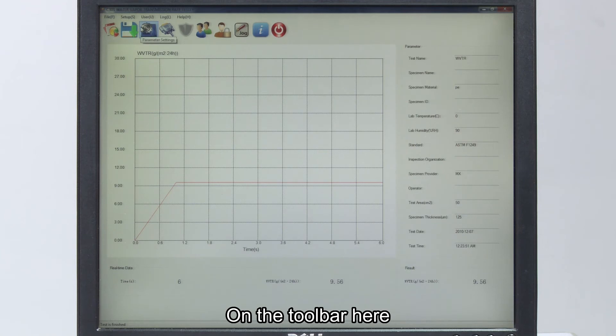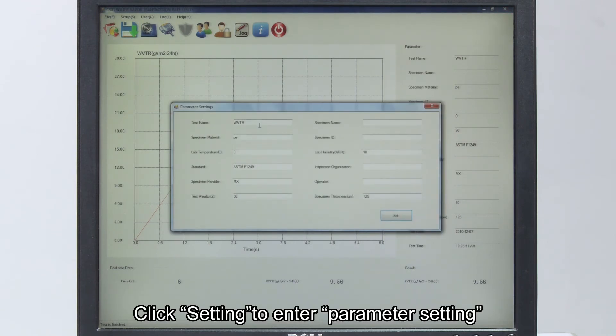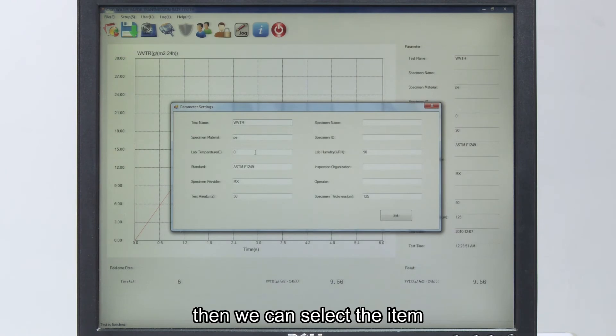On the toolbar here, click setting to enter parameter setting. Then we can select the item, preset, and save the parameters.